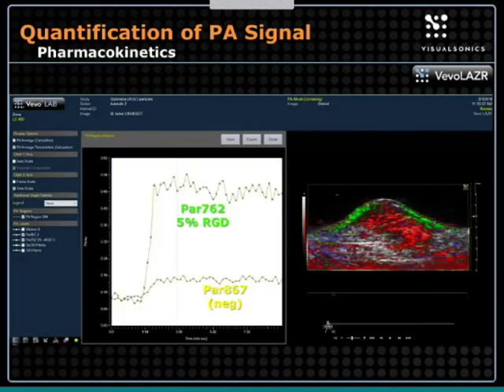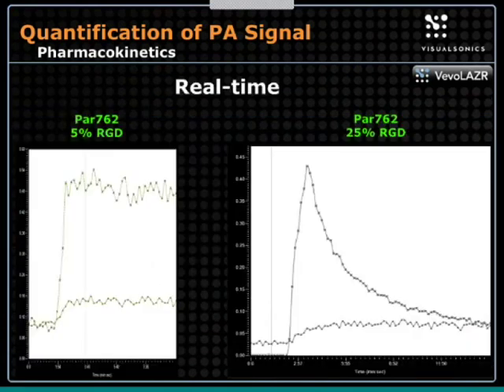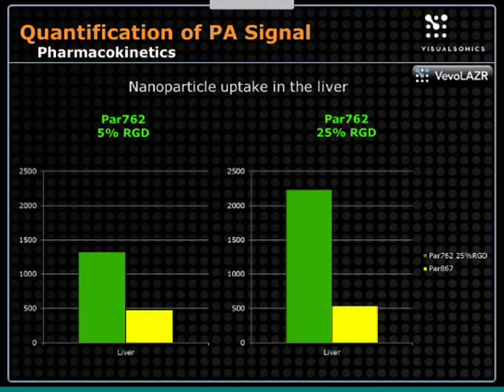Where is it? Over here. After the in vivo experiment, I perfused the animal, took the livers out, and imaged the liver itself. You could do this in vivo. There are also some applications where people are just basically incubating their contrast agents in a dish with tissue. Now, certainly you could do photoacoustic imaging in that case. It would be quite easy.